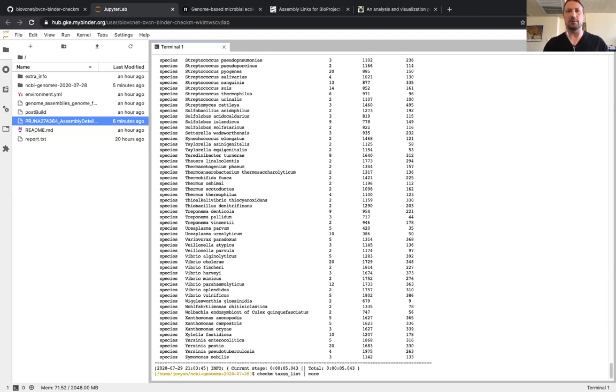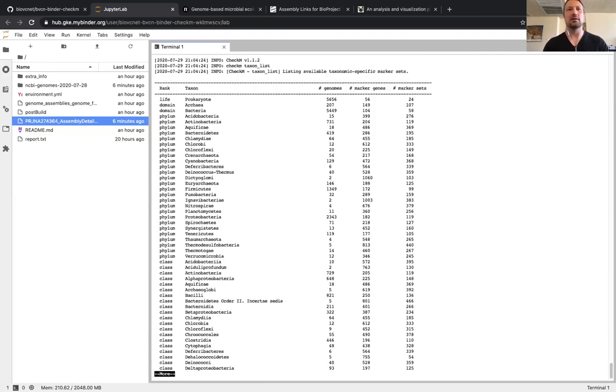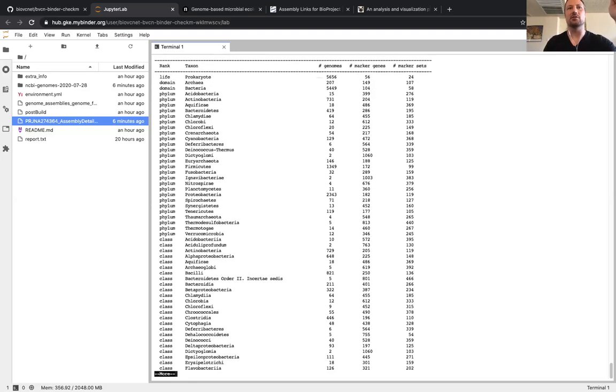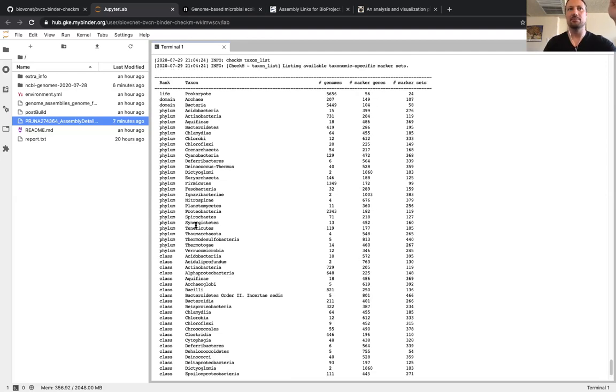We're going to do it with more. All right, change that in the tutorial. There we go. So now we'll see the top, and we see that we can scroll down, and we see there's a chunk of phyla available, but not all that many, all things considered. For example, there's only, say, 2, 3, 4 archaeal phyla, probably a little bit more.